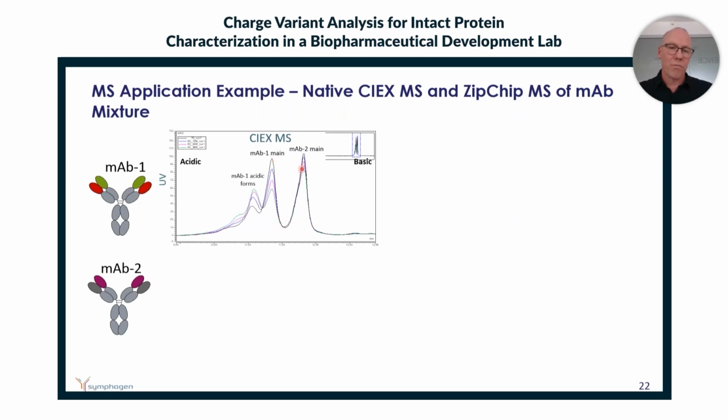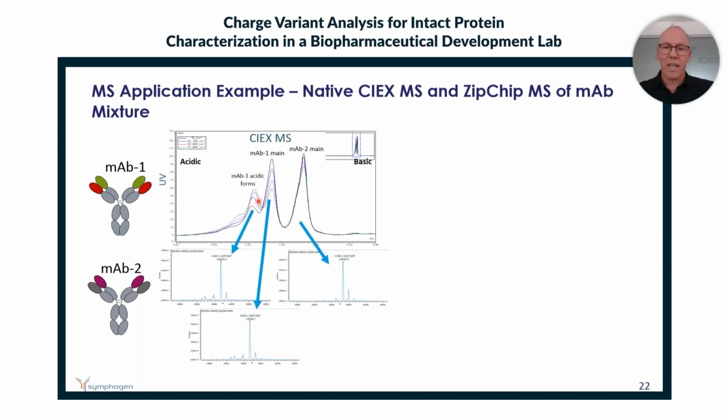And here you can see we're struggling a little to separate it by ion exchange, but we can clearly see that antibody 1 is dropping. This is, again, a real-time stability study. We can see that the acidic form is increasing, and we know that this is a deamidation. And we see that by the cation exchange. We then did the same. We verified the masses and confirmed that this was deamidation, so nearly no mass shift, a very modest mass shift around 1 to 2 Dalton.